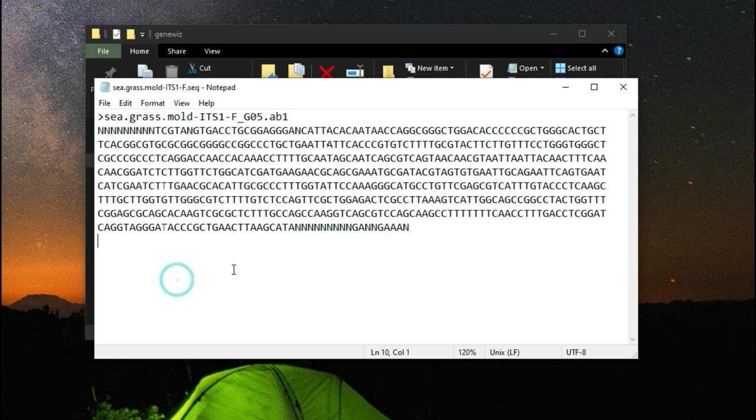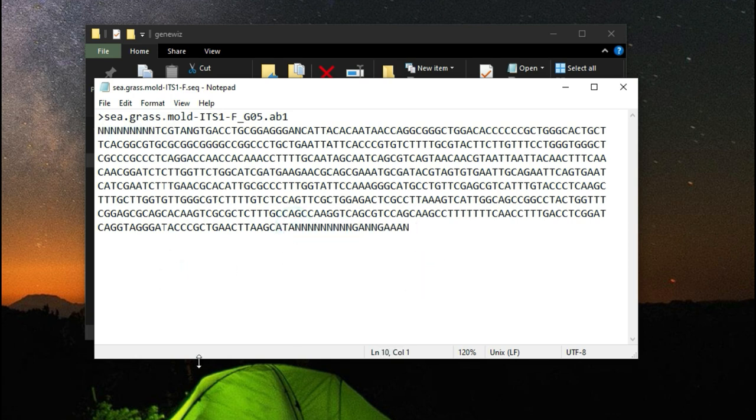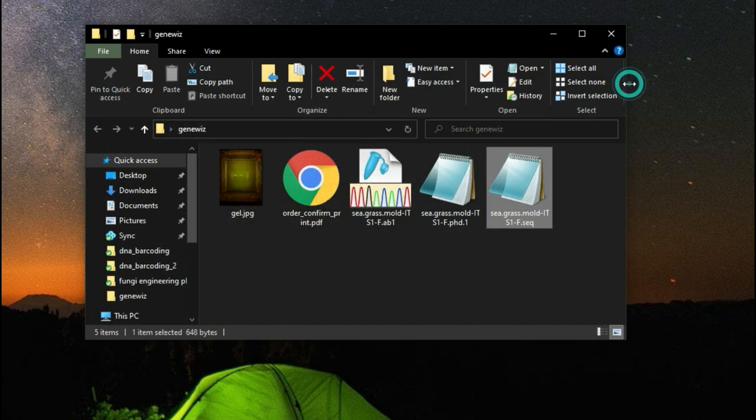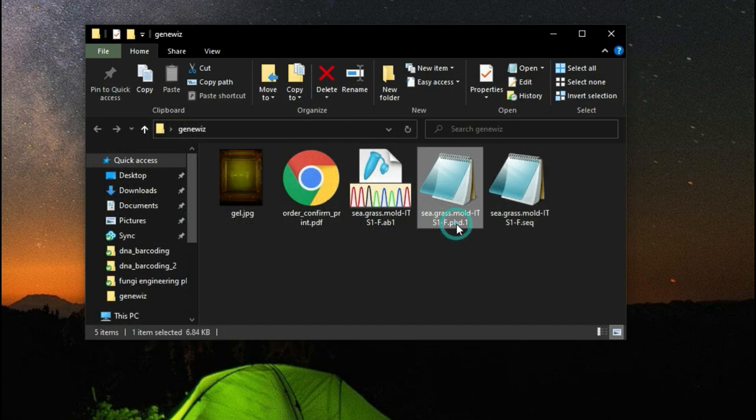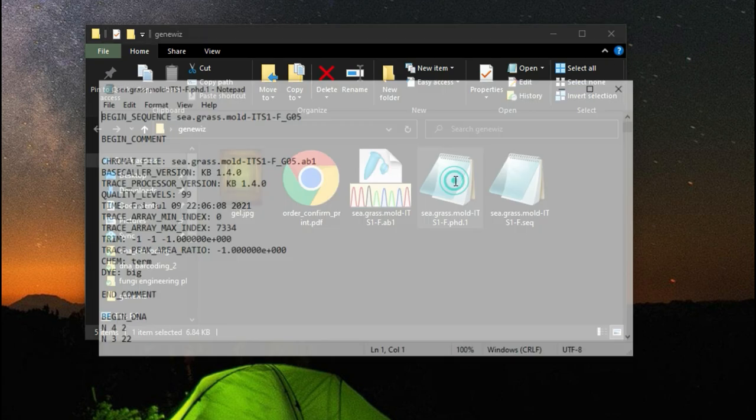Just know that with Sanger sequencing you'll usually need to trim these regions off from the sequence before comparing them. It is possible to have ends in the middle of the sequence and we can look at the underlying signal data in the chromatogram we downloaded to see if it's possible to discern the correct base and edit the sequence accordingly.